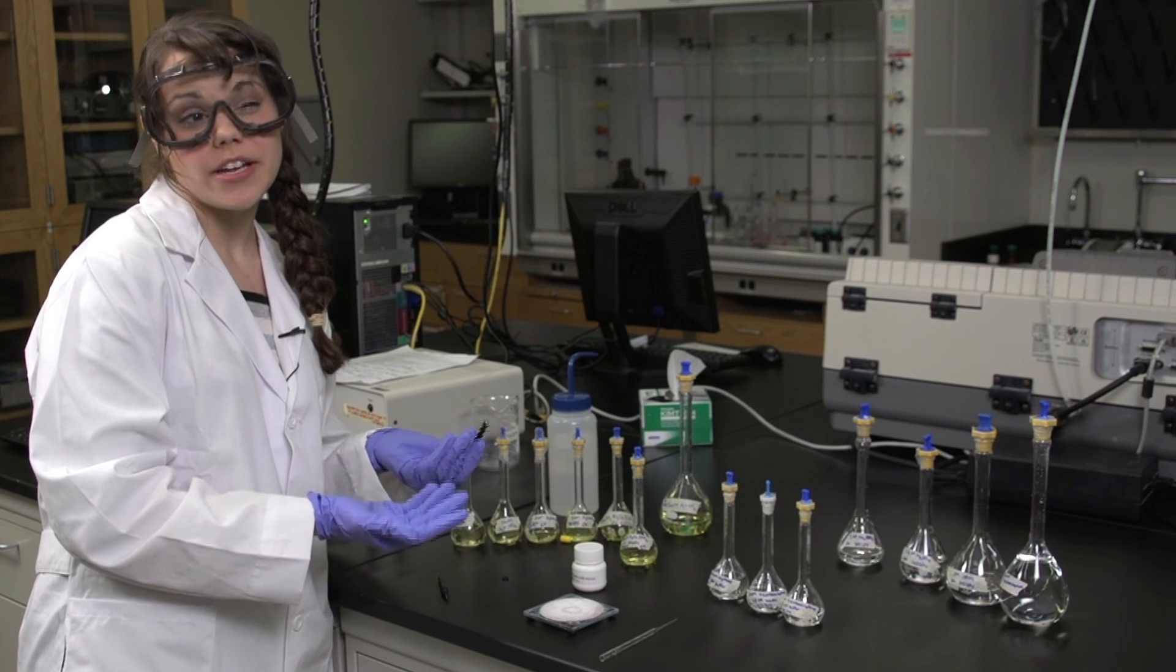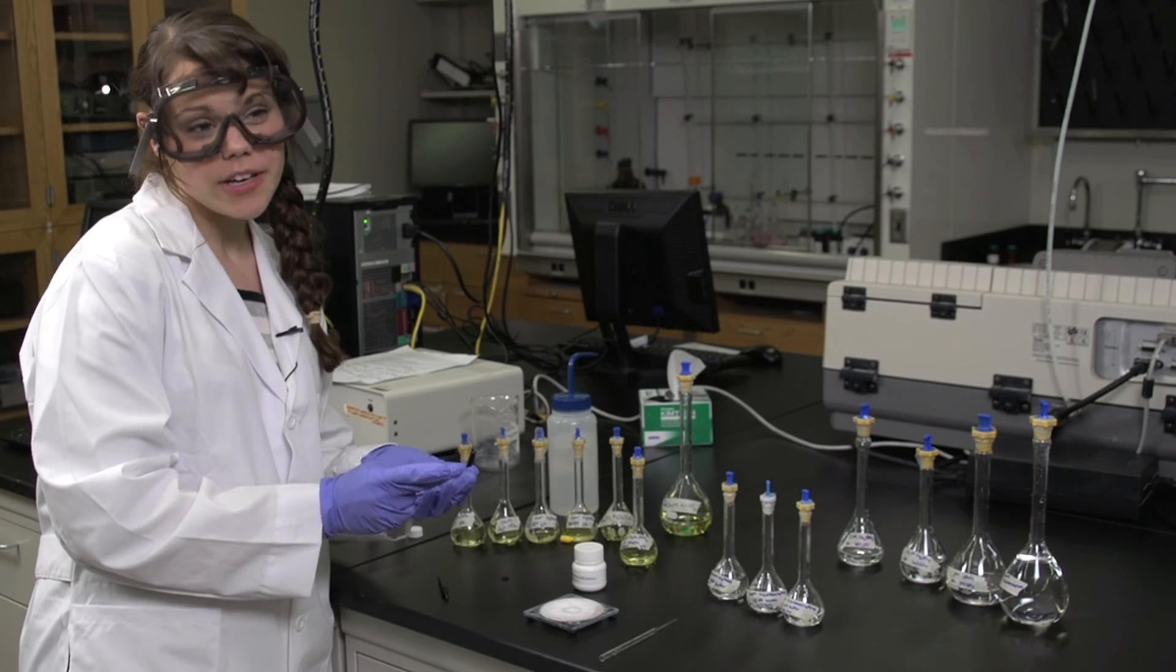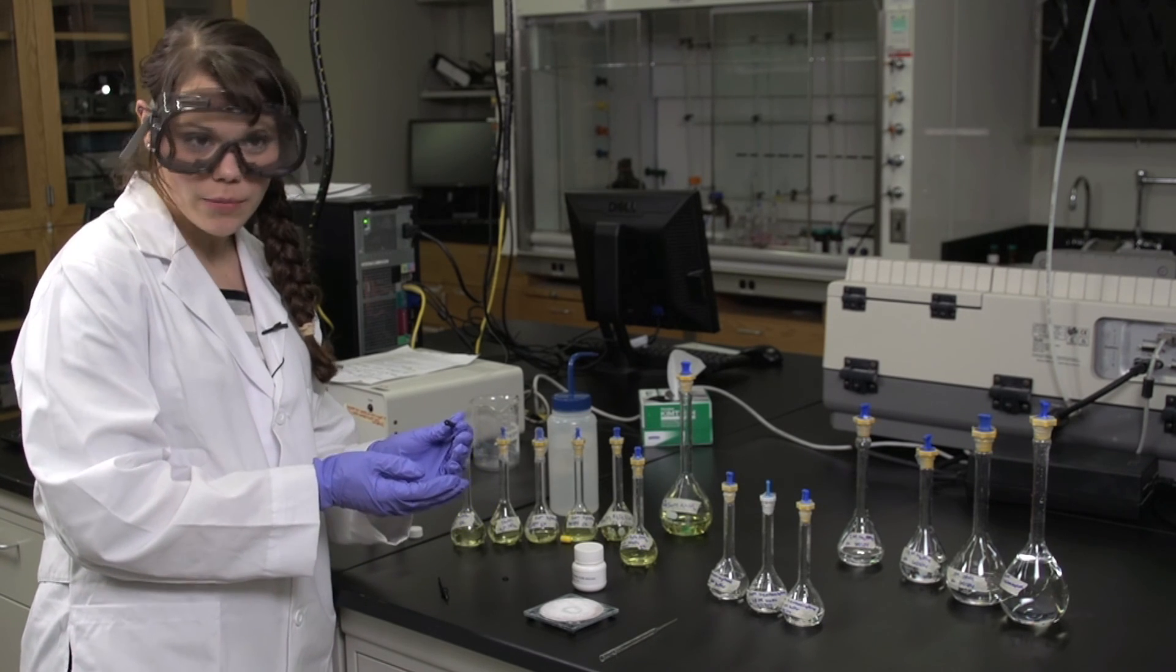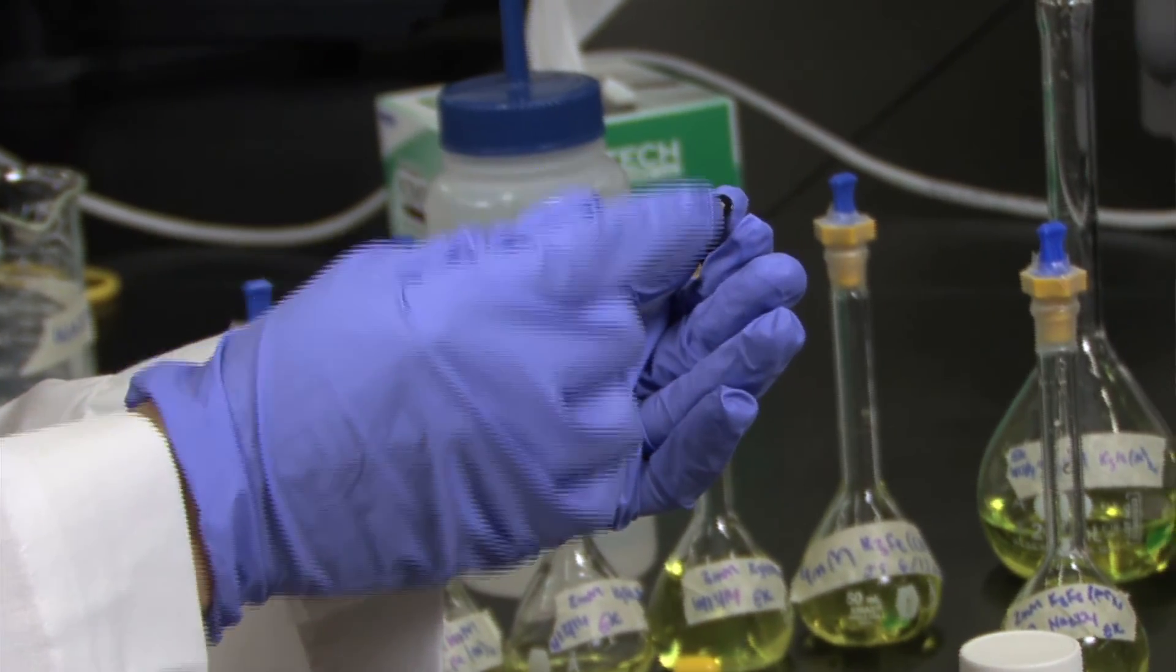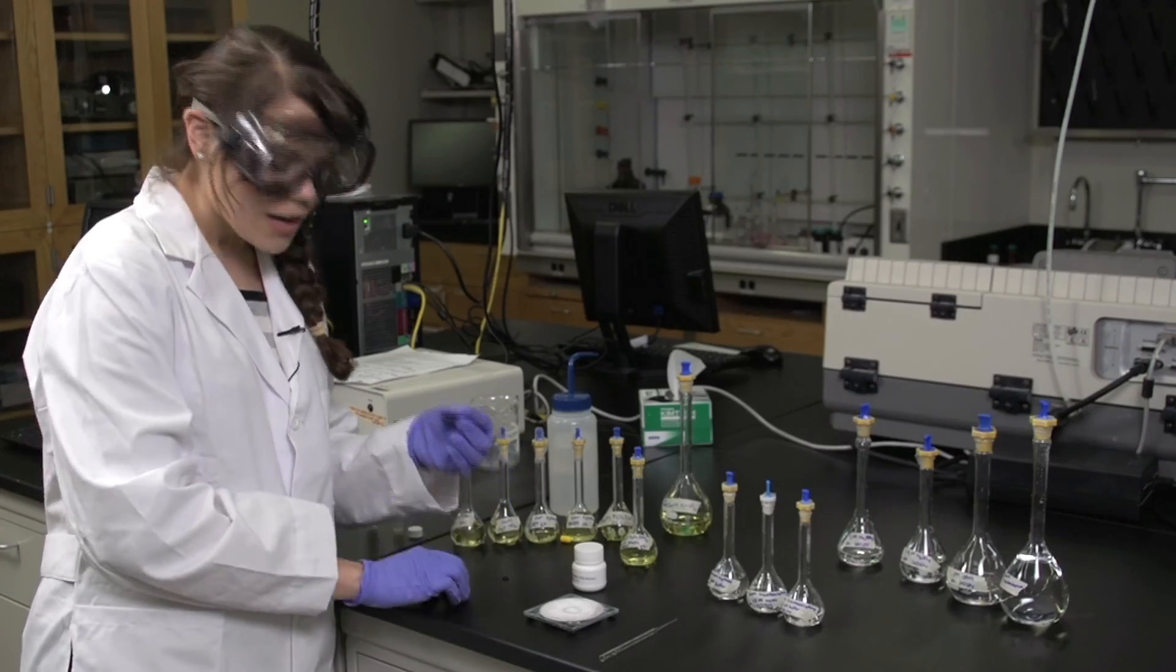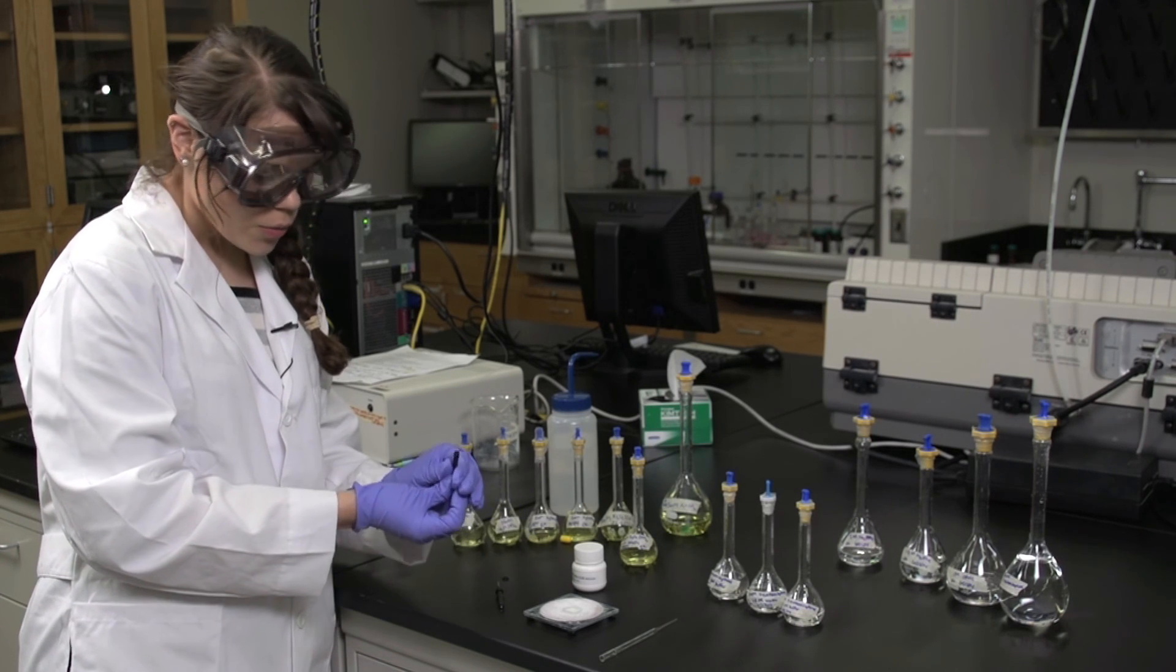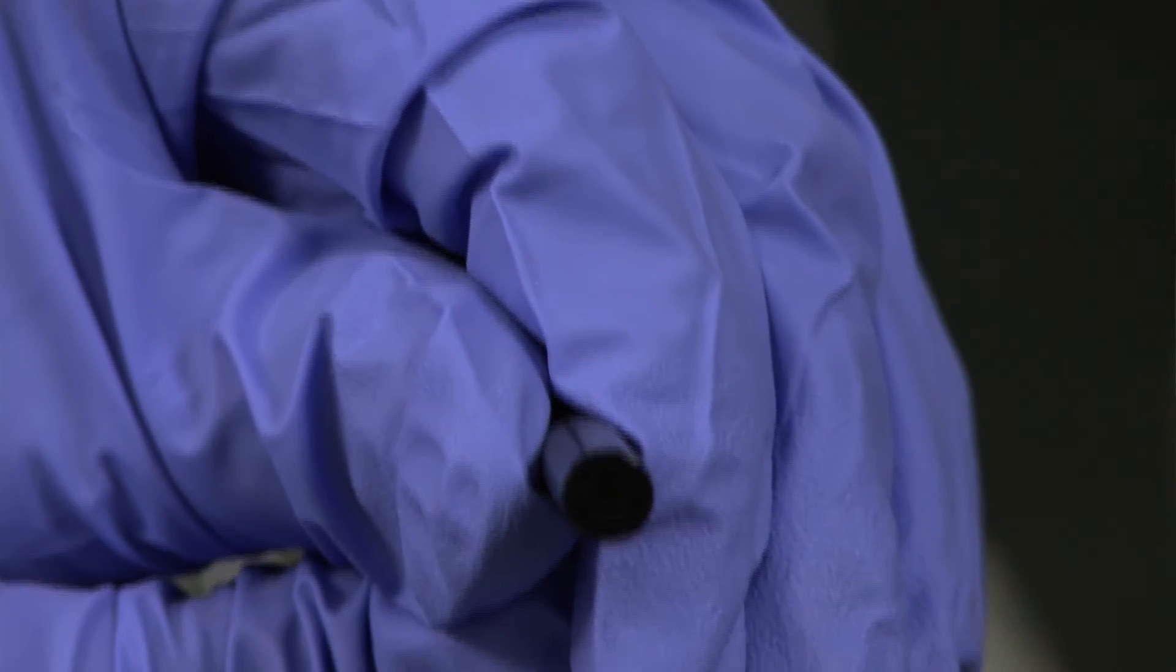Before you're ready to begin your experiment, you need to polish the working electrode. There are two working electrodes you'll be using throughout this experiment. On day one, you'll be using the platinum working electrode which has a silver shiny metal bottom. On day two, you'll be using a glassy carbon working electrode which has more of a shiny clear glass appearance.